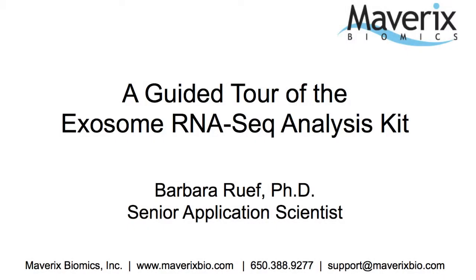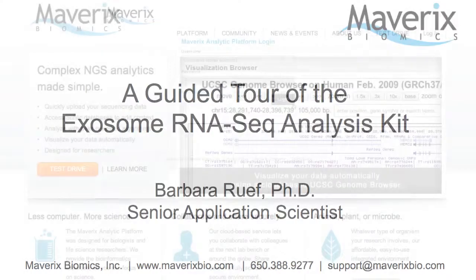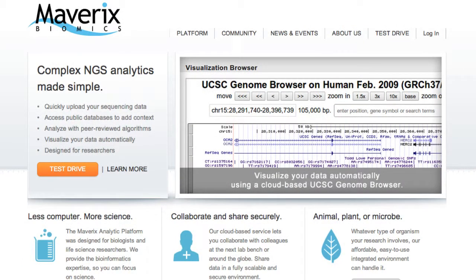Hello and welcome. My name is Barbara Roof and I'm an application scientist here at Maverix Biomics. The Maverix analytic platform integrates everything you need to manage, explore, and visualize your next-generation sequence data in one easy-to-use system. In this video, we'll start with a brief orientation of the platform and dive right into a guided tour of our exosome RNA-Seq analysis kit. Let's get started.